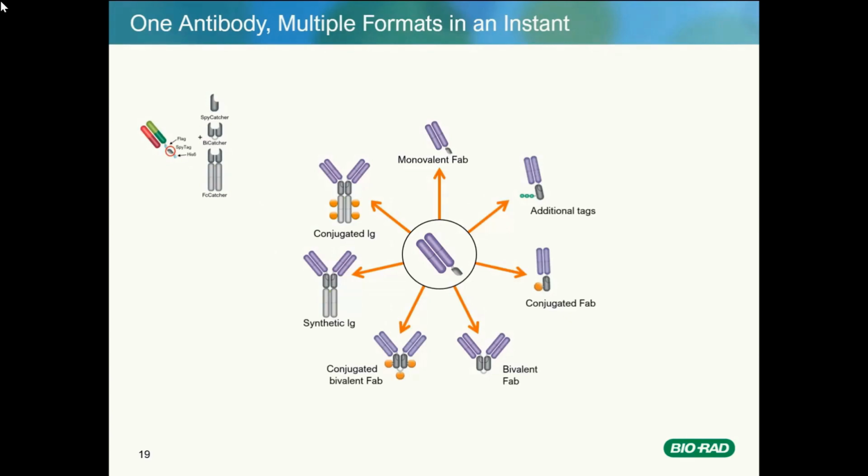With QC added for the coupled antibodies, only one more week is added to the antibody generation process, 8 weeks to 9 weeks to receive these coupled antibodies.